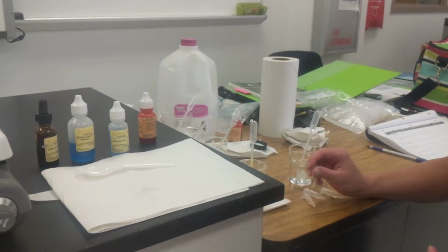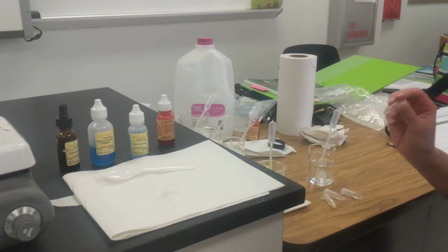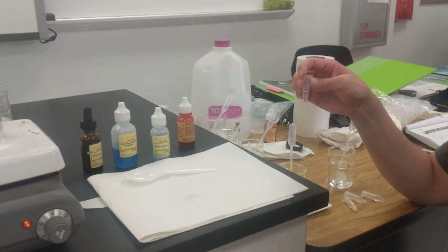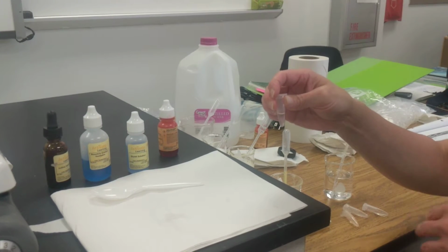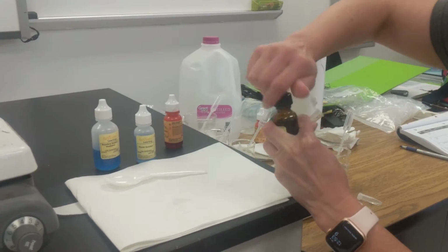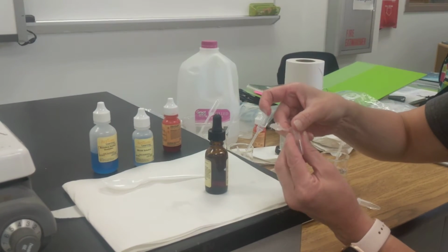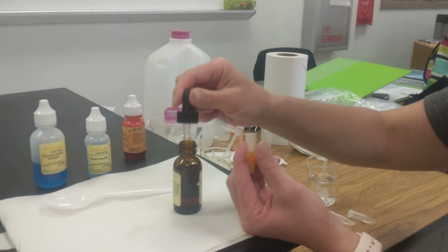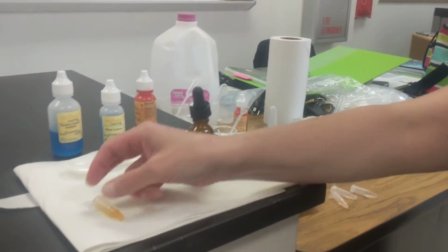All right, so hopefully we all have our predictions filled out for starch, sugar, protein, and fat. Does water have any of those items? So let's go ahead and move into our testing. Water is a clear liquid. We can see through it. There's no color. There's nothing to block our seeing through. So looks like it has absolutely nothing in it. So I'll start with our starch test. I am trying to make sure you guys can see that. Okay, and it's looking like it's staying a gold color. So no starch in our water.